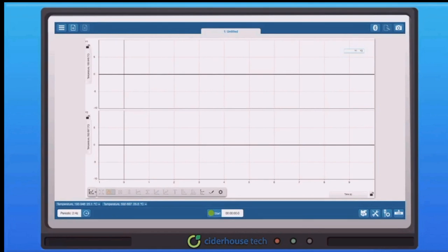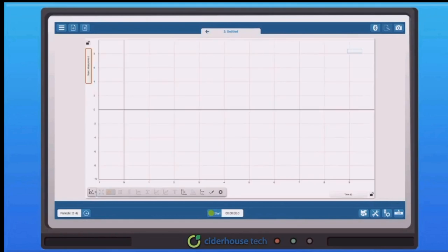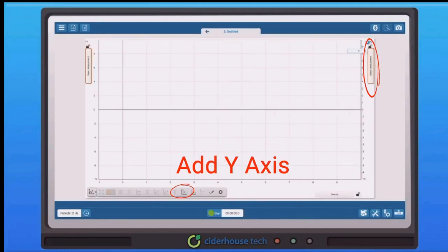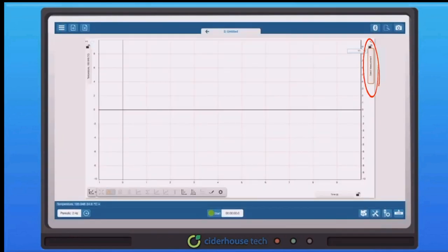To combine both sensors on the one graph, we need to build a page. To do this, we must select Build New Page. From the Build New Page display, we will select a full page template, then select the graph option. From the toolbar, we will select the Add Y-axis button. The new Y-axis will appear on the right-hand side. Click on the left-hand side Y-axis button and select the sensor. Repeat this for the Y-axis on the right-hand side.